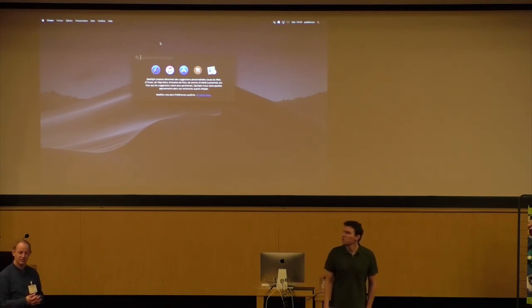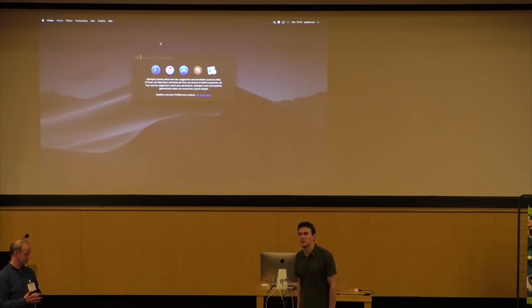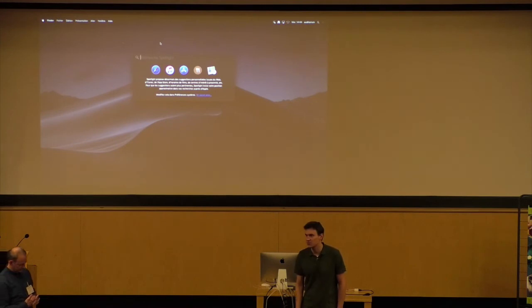C-flats. I use both. Most of the time I'm getting the sample from somebody and they tell me they want those grids, and I'm just using those. I was using both and I have different experiences with them, but both work fine in principle. What I have seen lately is that sometimes the proteins tend to stick more to the carbon on the C-flats, and I don't know why. Most of the time I'm using Quantifoil anyway, so 95% of my experience is with Quantifoil grids, and I use C-flats if the person says there is plastic on the Quantifoil, don't use this.